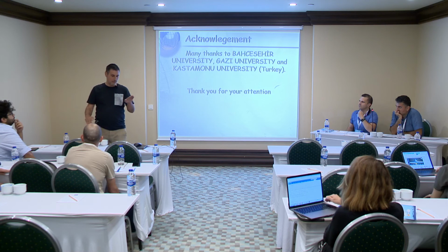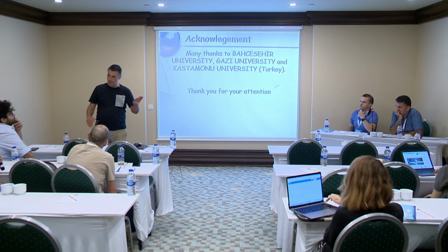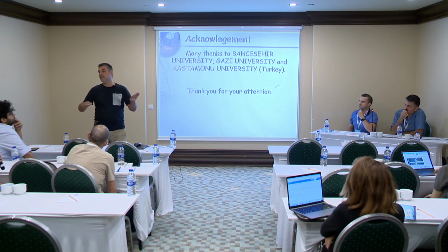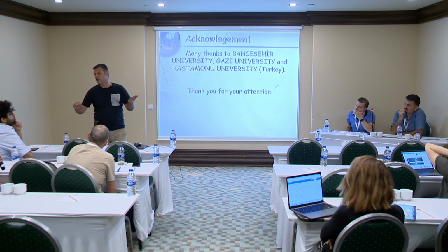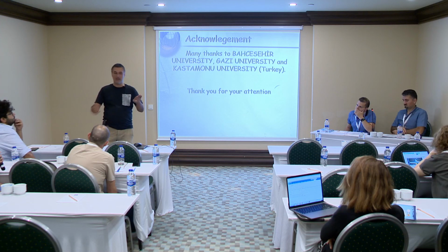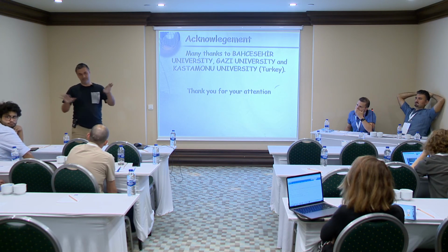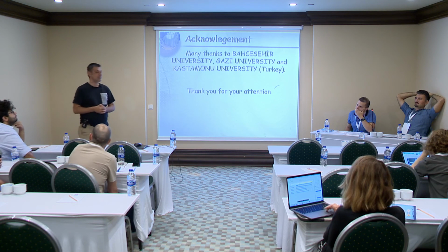That means we first took XRD with just the nanorods, and then we tried with the substrate, the seed layer and the nanorods. Because the seed layer is zinc oxide, I prefer the first one. Yes, also because you're using a Rietveld method. Yeah, we just have two different samples. Okay, thank you. You're welcome.